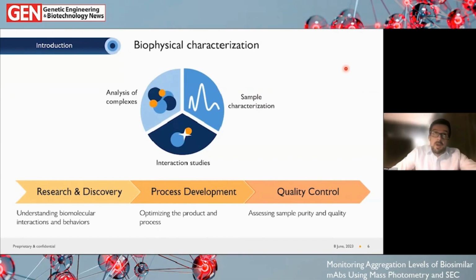or if you have something that's a drug that you have developed and you just want to check maybe how stable it is in a particular formulation, so maybe part of a formulation screening assessment. So how stable is it within that formulation? Or if you want to monitor purity over time. So over time, where, say, drug product shelf life is concerned, is the species that is the active therapeutic component still there if we store a drug product for a long period?